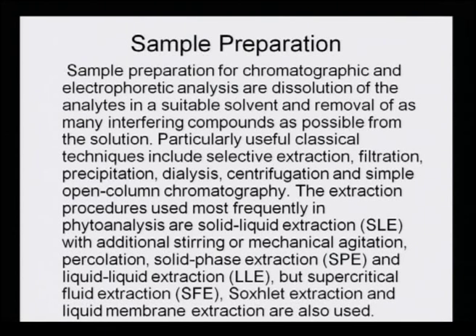The extraction procedures used most frequently in phytoanalysis are solid liquid extraction, SLE, with additional stirring or mechanical agitation, percolation, solid phase extraction, SPE, and liquid-liquid extraction, LLE, which I have repeatedly talked about. But supercritical fluid extraction, SFE, is also picking up and is very important. The Soxhlet extraction and the liquid membrane extraction are also used and are useful.